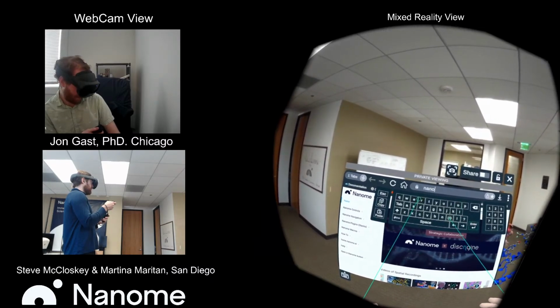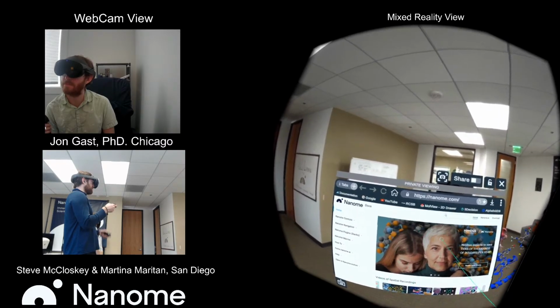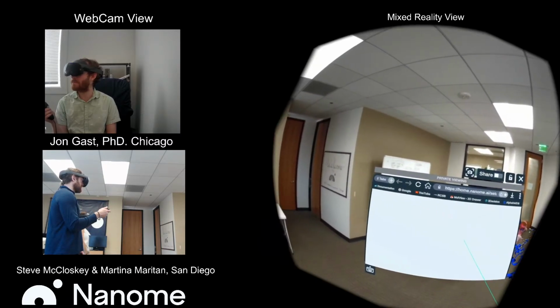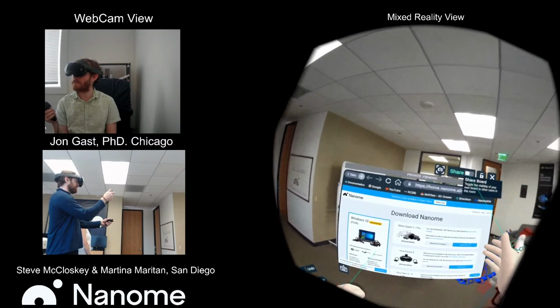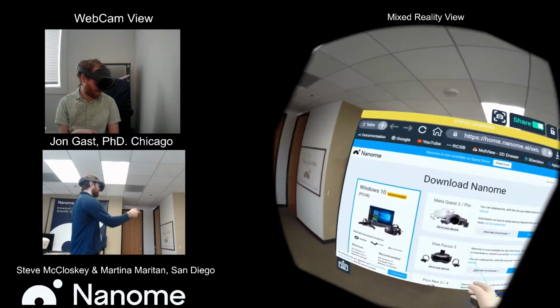So you go to nanome.ai. You could also just go to nanome.com. It'll redirect you. And then we have the download page. I'll share the browser so you can all see it too. So these are all the devices we're compatible with.